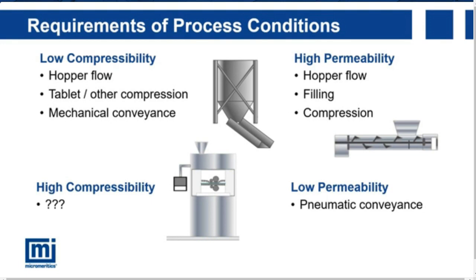As I've already mentioned, high permeability is also usually a good thing. In hoppers, it prevents pulsative flow, and in both filling and compressive operations, it allows built-up air to readily escape. However, in pneumatic applications, particularly when powders are being transferred in the dense or plug phase, low permeability is usually preferable.